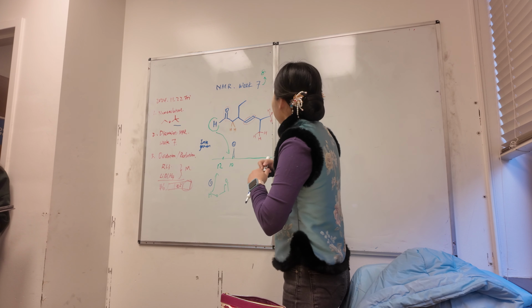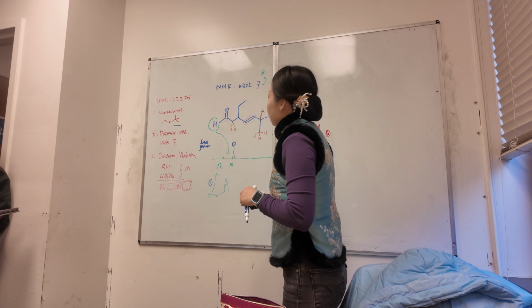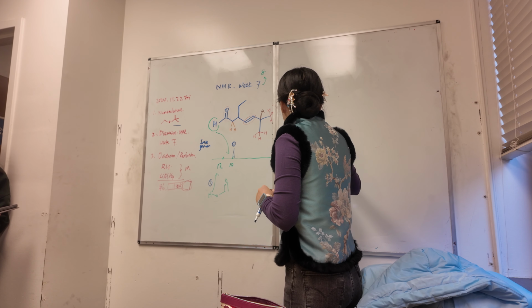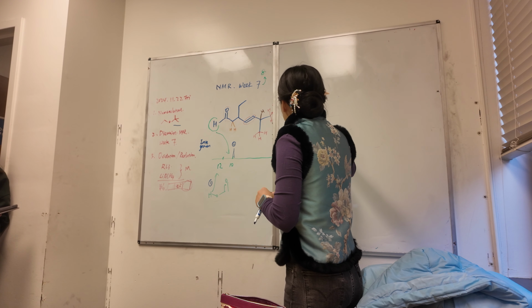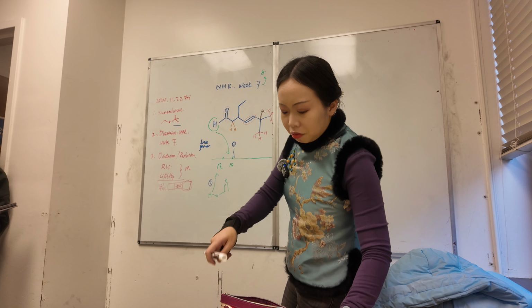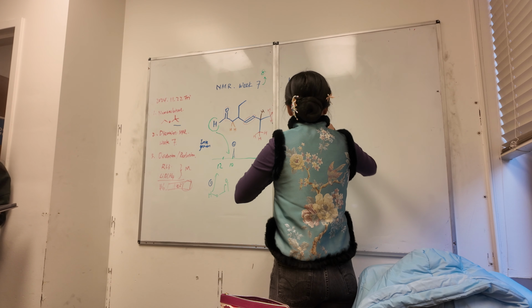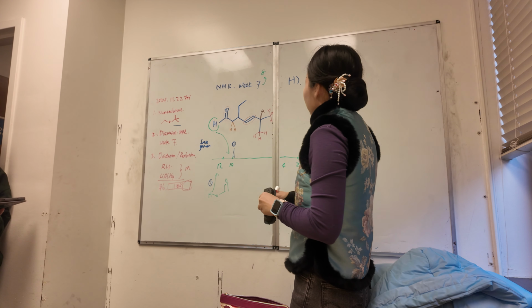We only do integration. Okay. There is a brown hydrogen. So that one probably will be a little bit closer. It's only 1. Maybe I should make that 6 a lot higher. Okay, a lot higher. That looks like a 6 to 1.